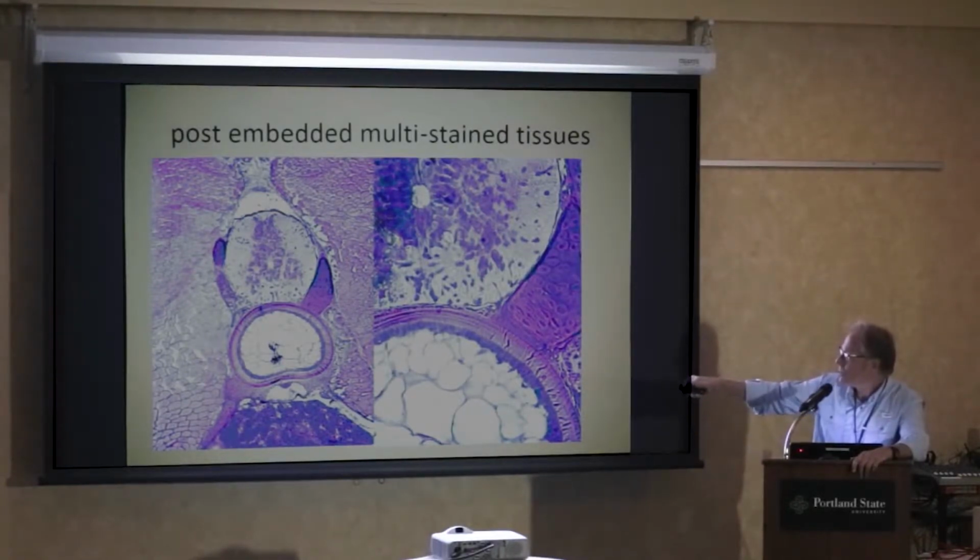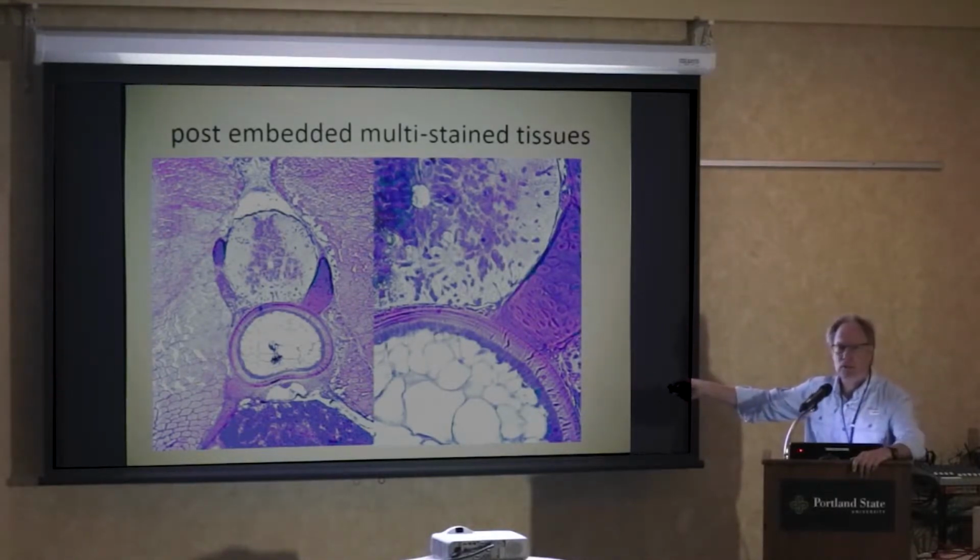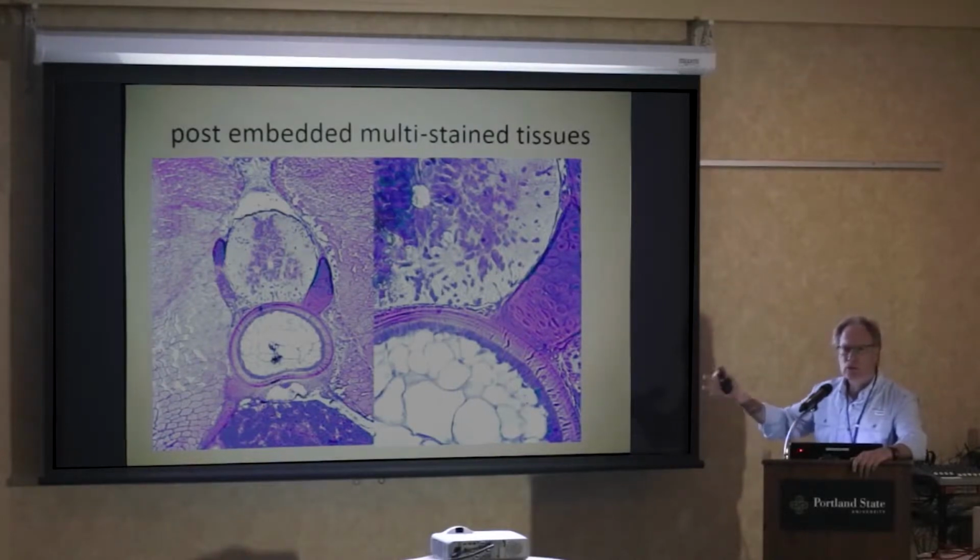There's the neural tube that is entirely ectodermal, and based on the idea that you have Giemsa in there, you're picking up the nuclei in the cells of the neural tube versus basically what is all going to be the axons of the gray matter. So it really shows a lot compared to the previous slide. And this is just basically a higher magnification of the same thing.